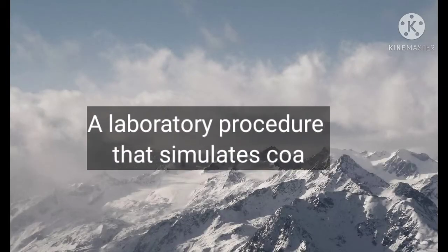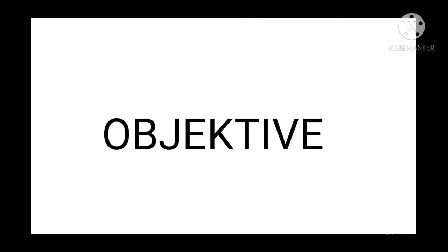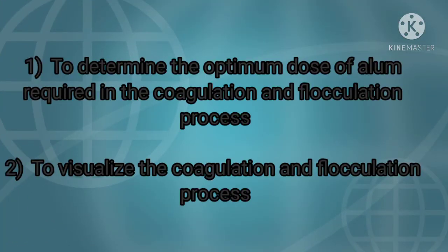A laboratory procedure that simulates coagulation and flocculation with differing chemical doses. The objectives are: number one, to determine the optimum dose of alum required in the coagulation and flocculation process. Number two, to visualize the coagulation and flocculation process.